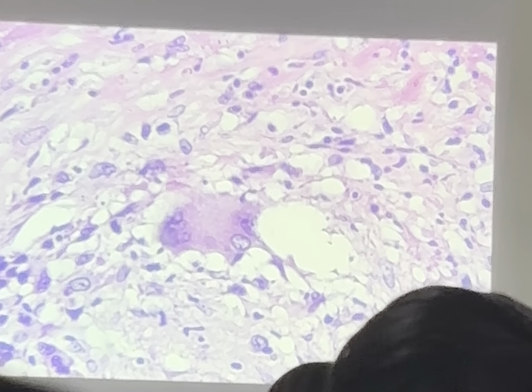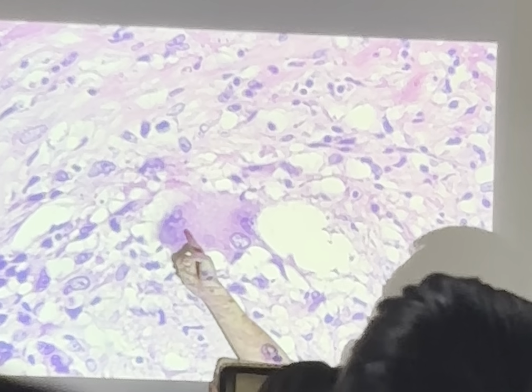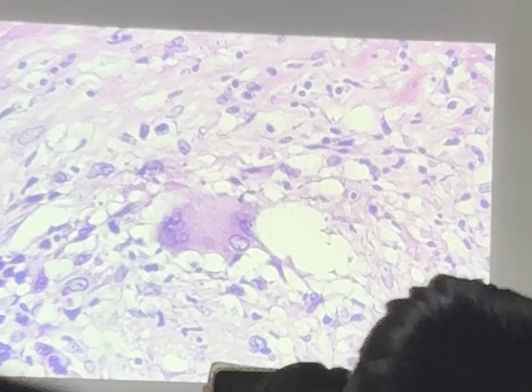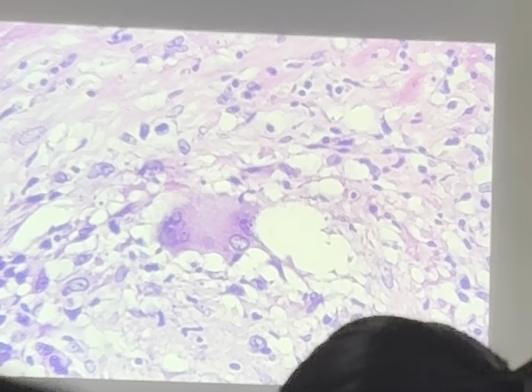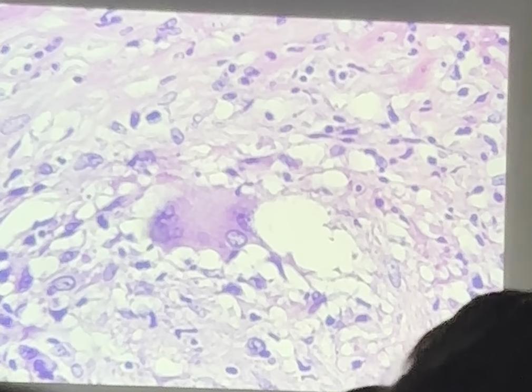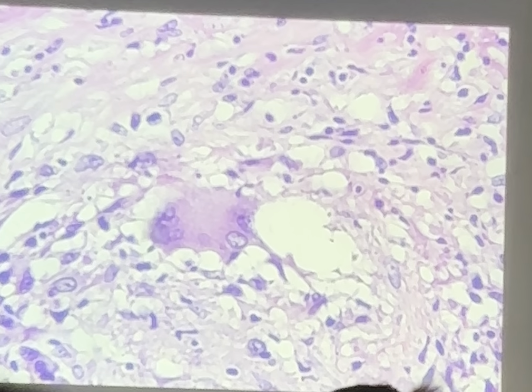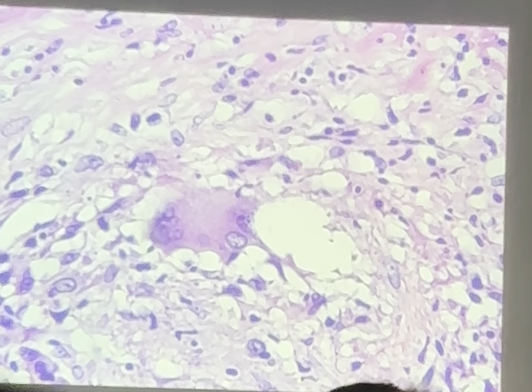Notice the arrangement of the nuclei is kind of somewhat like a U or letter C. Kind of, sort of, not perfect. What is that multinucleated giant cell that has that C shape or horseshoe shape arrangement of the nucleus? That is the Langhans giant cell. Correct. Not to be confused with Langerhans. Okay? Those are different cells.